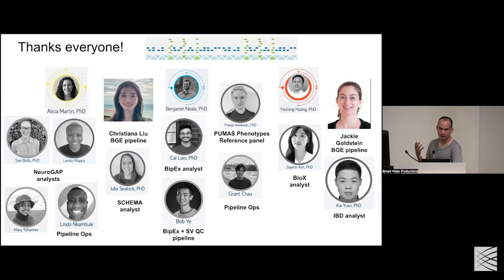And I think the low pass approach really, in the long term, aside from the inevitable, if deep whole genomes for everyone ever truly gets down to a cost competitive with this, is that you can go to basically any population in the world, and with the right reference panel, you're not systematically ignoring the sort of variation that may exist there, whereas with the array approach, you have the possibility that we are underserving what we can see in the landscape of variation. And so really excited about this, and thanks.